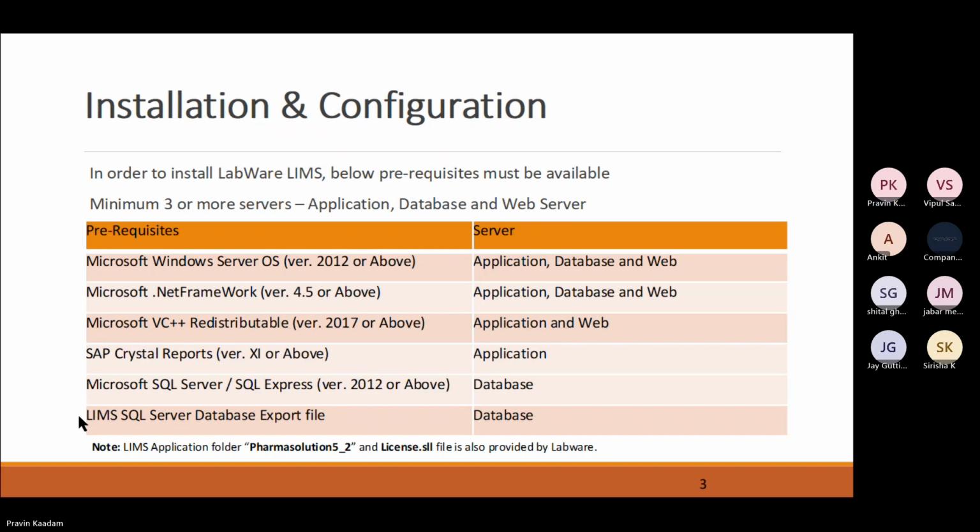Okay. Then the Microsoft .NET framework should be at least 4.5 or above in all the 3 servers. VC++ redistributable should also be present.